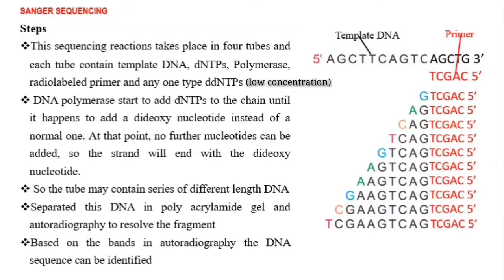That means we will separate these different fragments of DNA using polyacrylamide gel electrophoresis, and expose this gel for autoradiography, because the primer is radiolabeled.